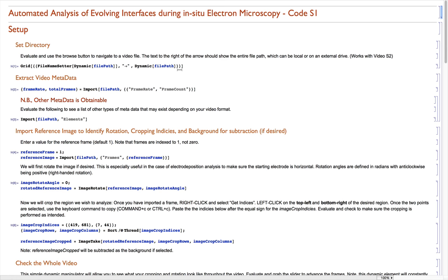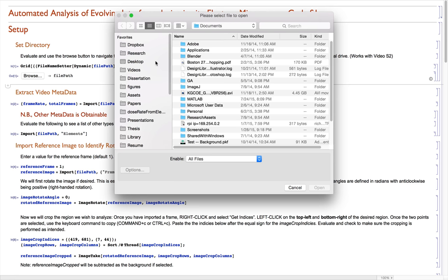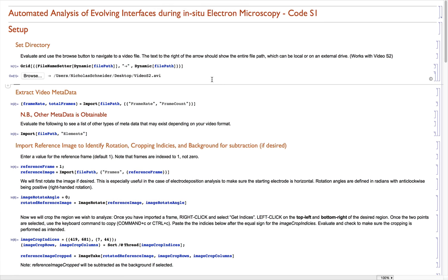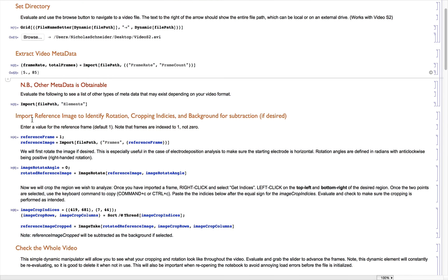In Mathematica, if you haven't used it, you can use shift return to evaluate a line. The first one here will let us set the directory for whatever video we are using. The sample video that we need is going to be video S2, and I had that on my desktop. So now we have set file path to the location of the video. We can go through and import some of the metadata about the video, such as the frame rate and the total frames, as that will be useful in the analysis.